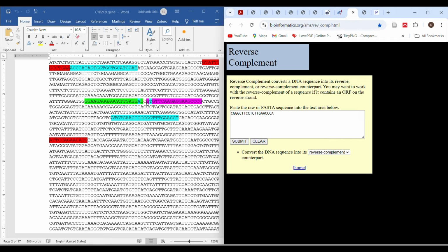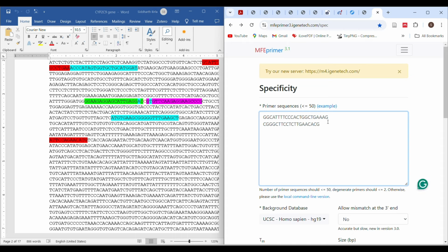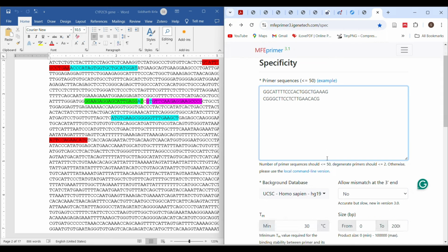So you can see here very clearly this T is the mismatch and this C is also. So when we come here, we have added the mismatches at the 3 dash and first position. I mean, we have removed the mismatch, and same way here also. Just need to now run it.